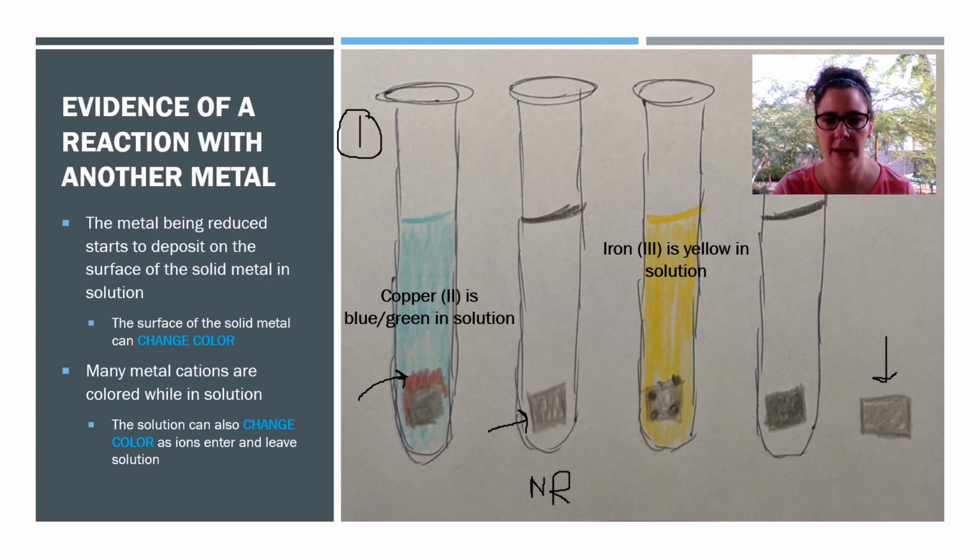Okay, so this one here, I tried to draw with starting to get dark spots on the metal. Sometimes you get what looks like crazy fur growing on it with all that metal depositing. Sometimes it's more subtle, and you'll start to see dark spots forming on the surface of the metal. So that's what we see in this one. This one here is a lot more subtle.